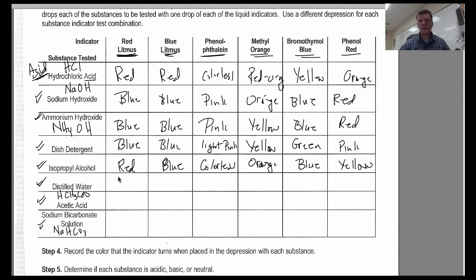Distilled water, we had stayed red. This stayed blue. Colorless. This was orange. Blue. And orange. The acetic acid, this would have stayed red. This one turned red.